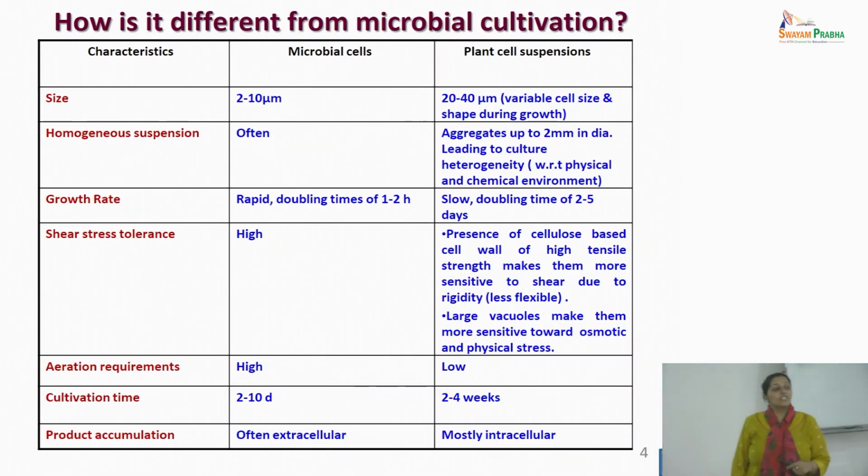So what implication will it have in your choice of reactor design? You will have to look into long drawn fermentation, the sterility maintenance. Although on paper in a lab, you may say that a complicated design may seem to be working well, let's say with high aspect ratios, a photobioreactor, and you have made all sorts of changes in the geometrical design to improve your mass transfer, but always keep in mind the scalability.